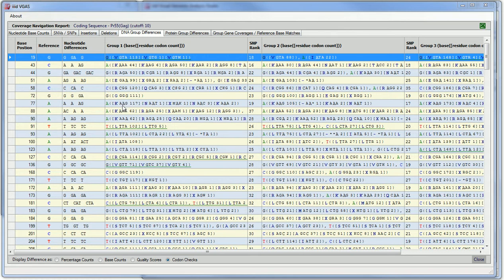So the second base is the A. So AAG is a K, AAT where we have 1 is an N, MAK where we have 1 is an X, and we have another K where we have an AAA which just occurs twice.